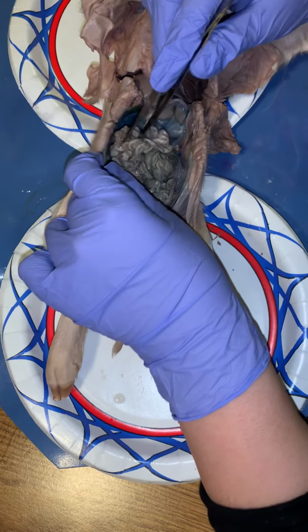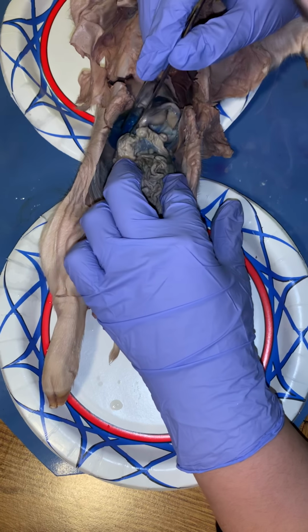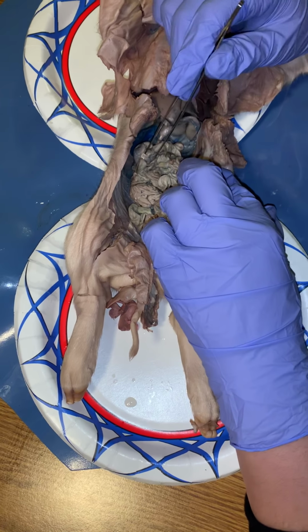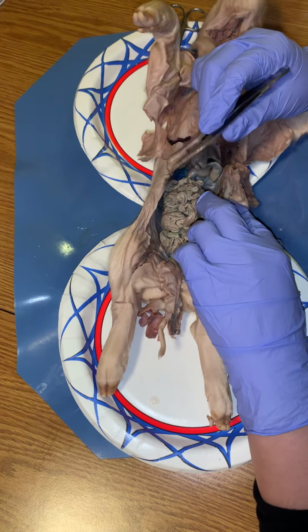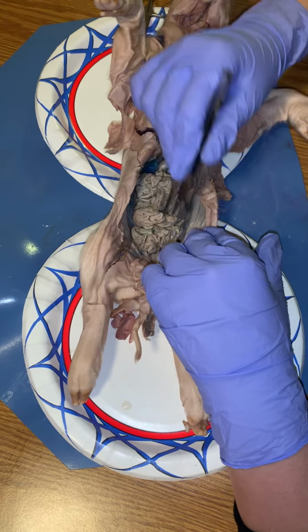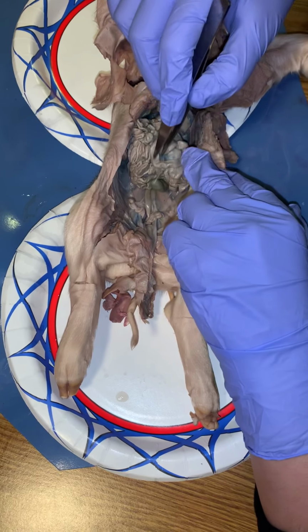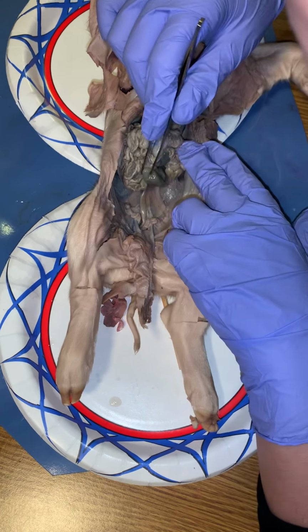which I've kind of messed up with my fingers through my dissection prior to taking the video, but all of these are the small intestine. The cecum is found over on this side. So we have the spiral colon next, and that's located just in this area. I know it's difficult to see, I do apologize for that because of me moving everything around. And then we have the rectum and the anus.